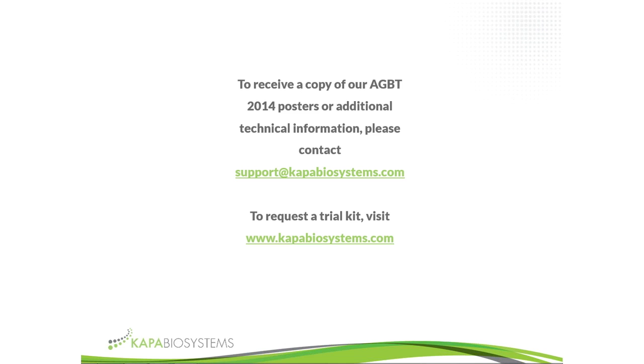Okay, we have time for maybe one or two more questions. How exactly does the Hyper Prep cause the higher conversion rate?